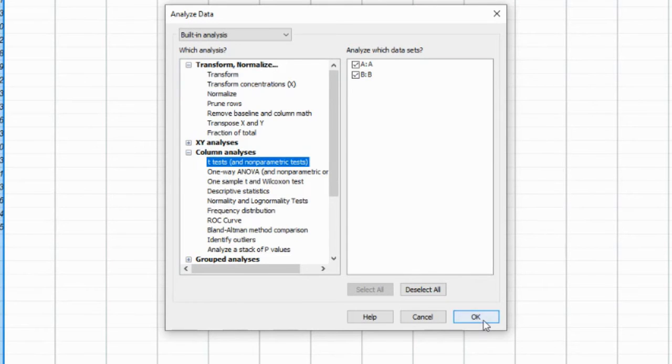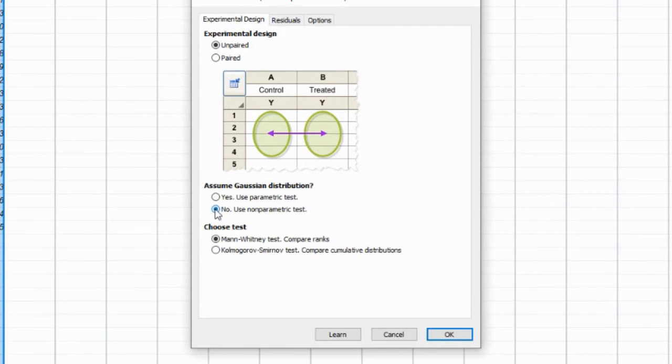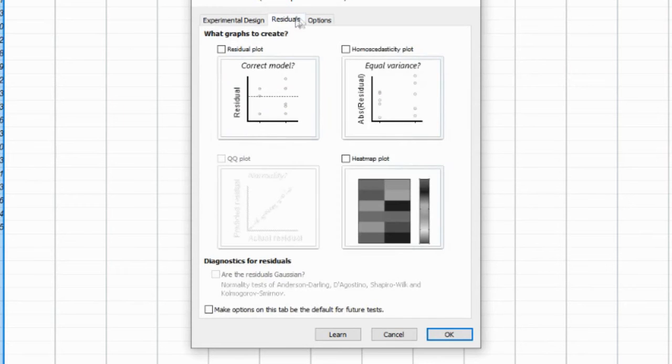In the Options section, you can also choose to plot the ranks as well as Mann-Whitney U in the additional results. Once you select this option, click OK to perform the test.